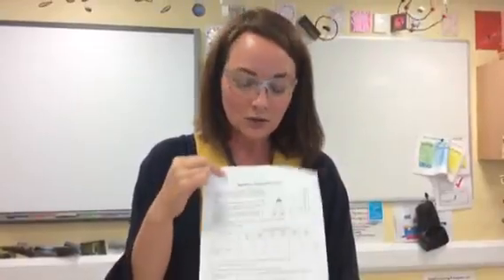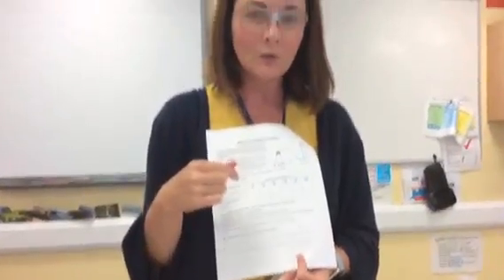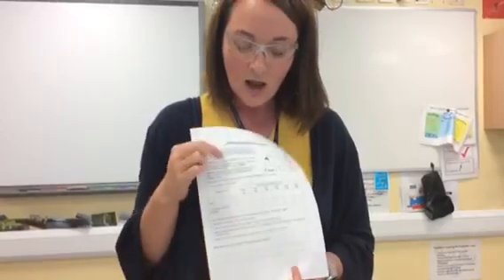Hello Year 10. Today we're going to be looking at the effect of catalysts on rates of reaction. So you've got this experiment sheet on Show My Homework. What we're looking at is doing one experiment without a catalyst and measuring the rate of reaction, and then using the exact same equipment but this time adding a catalyst in and seeing if the rate of reaction changes.